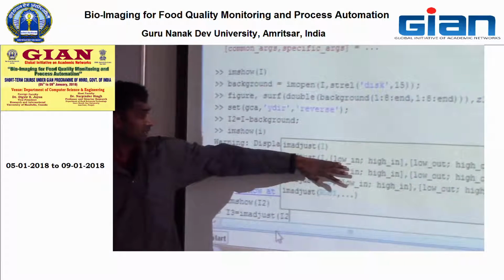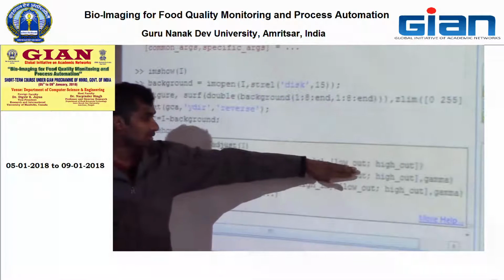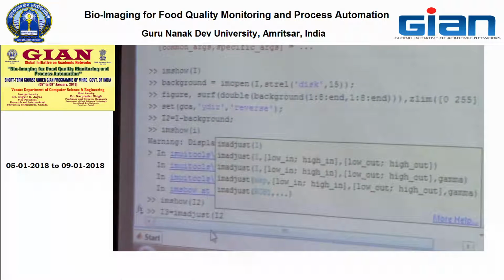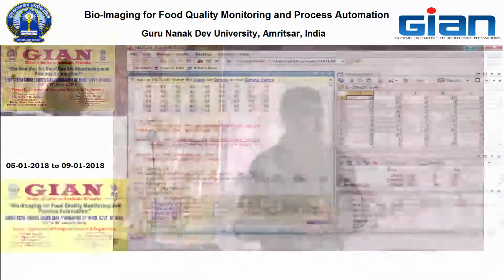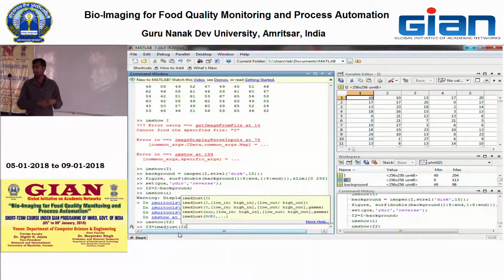If you put those in, you can get your image into whatever range you determine. All those commands will give you the options whenever you are typing. If you want to run the default, you can, or if you want to be more specific for your need, you can choose whatever you want.